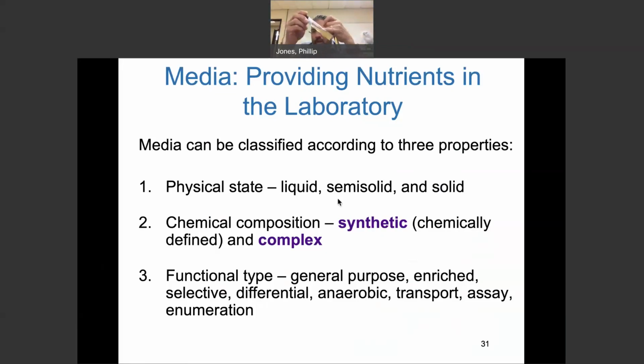So now I can visually look at this. I'll go grab one in a second and show you. I did some E. coli on there. I don't know how good my camera is on this MacBook, but there's nothing growing on there. Right. Here is the clear broth. Give me 1 minute. Just had an afterthought. I'll be right back.